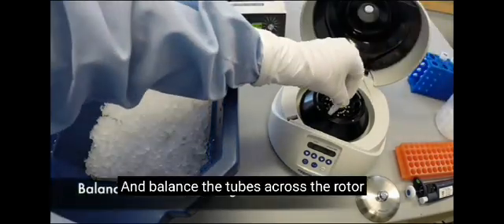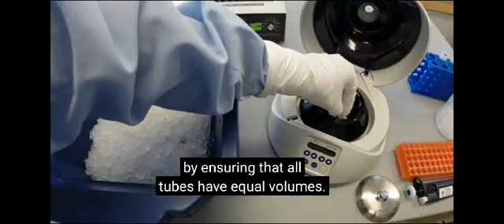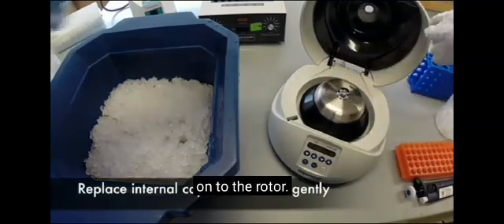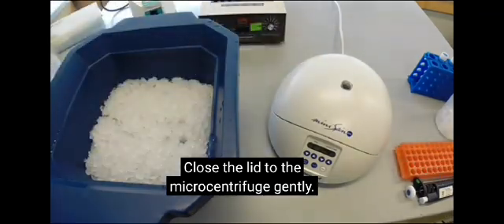Balance the tubes across the rotor by ensuring that all tubes have equal volumes. Replace the metal lid and press it until it clicks securely onto the rotor. Close the lid to the microcentrifuge gently.